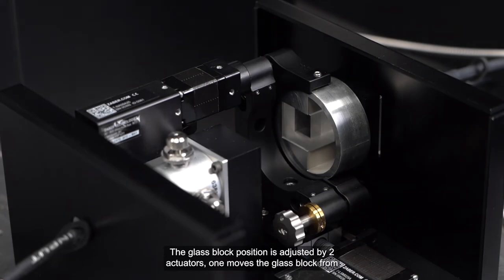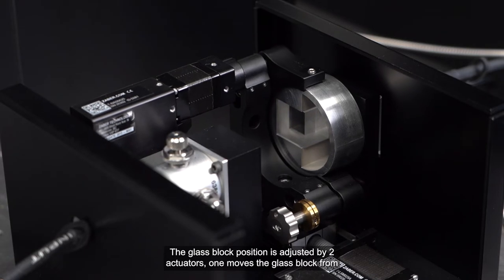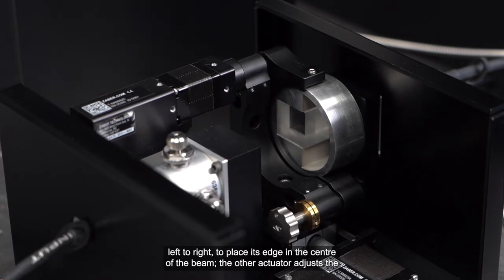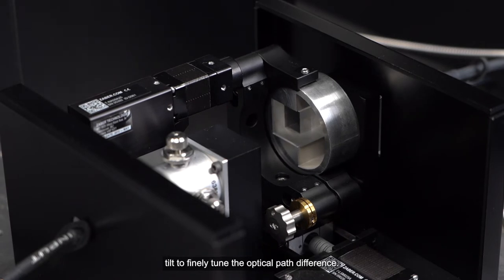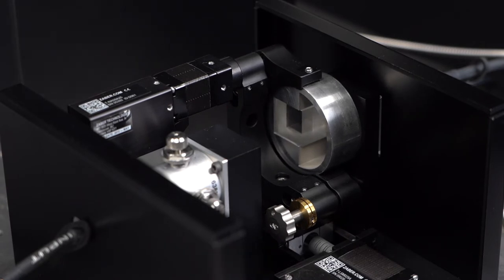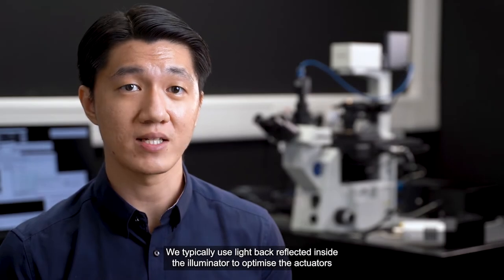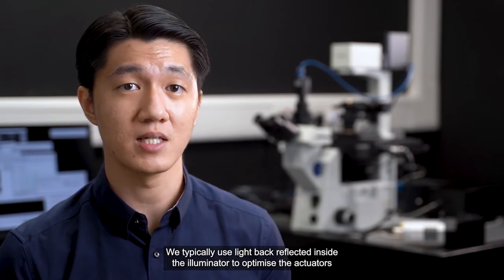The glass block position is adjusted by two actuators. One moves the glass block from left to right to place its edge in the center of the beam. The other actuator adjusts the tilt to finely tune the optical path difference. We typically use light back-reflected inside the illuminator to optimize the actuator positions.